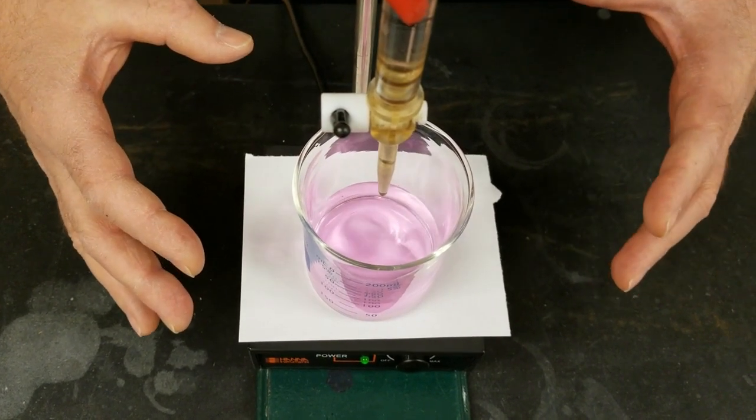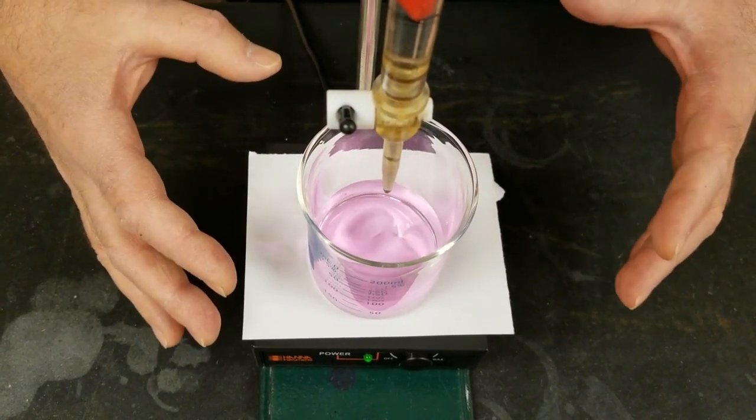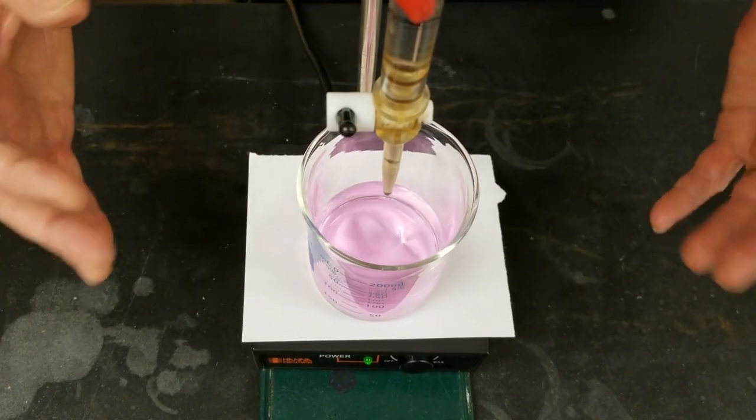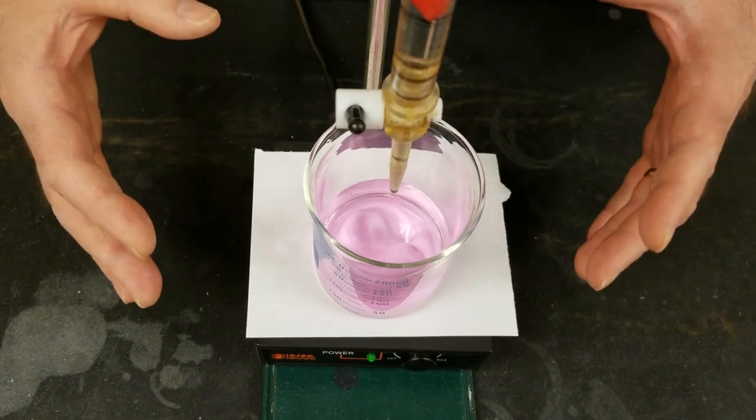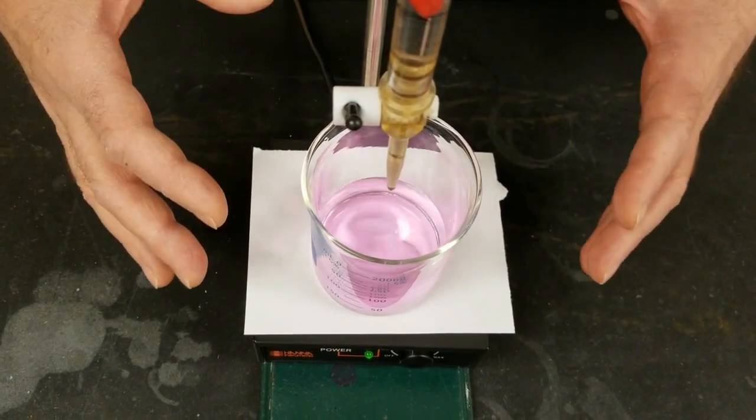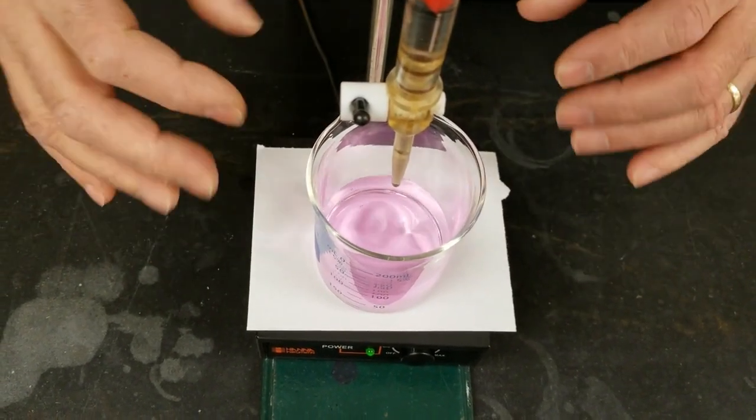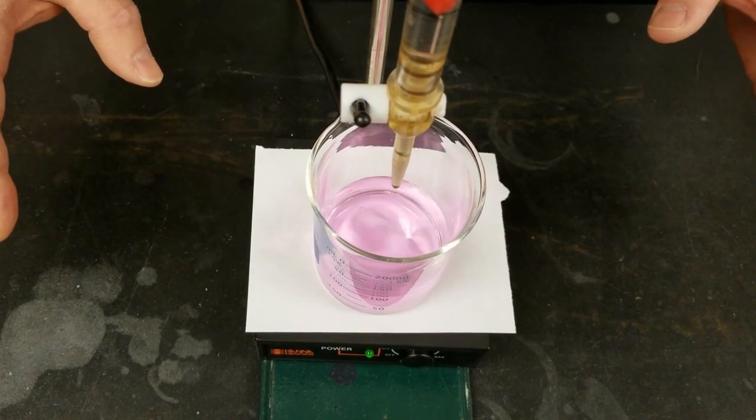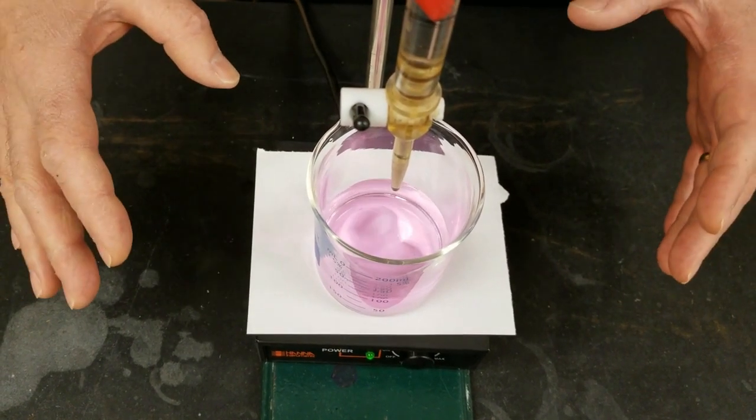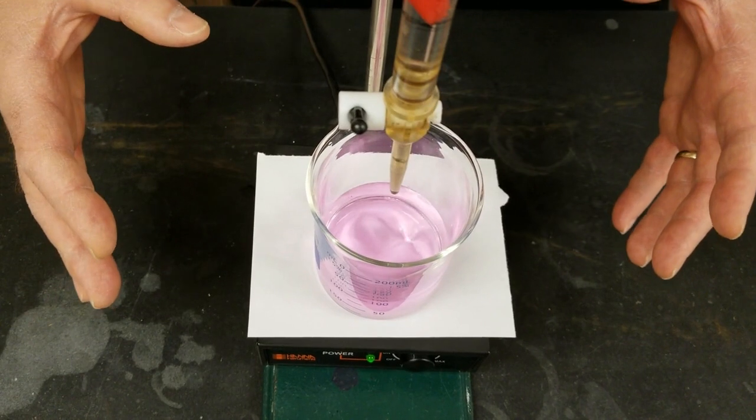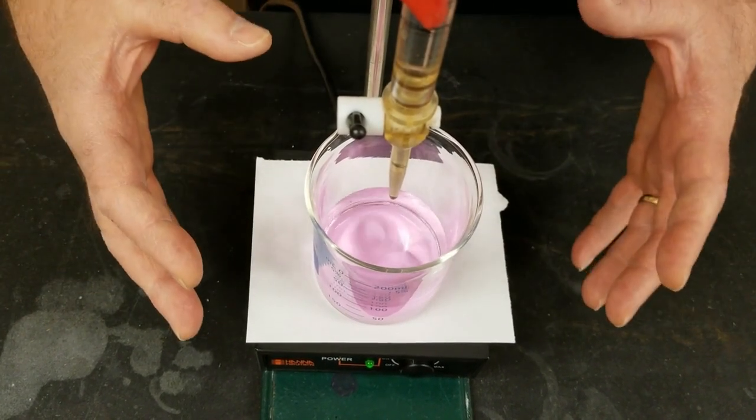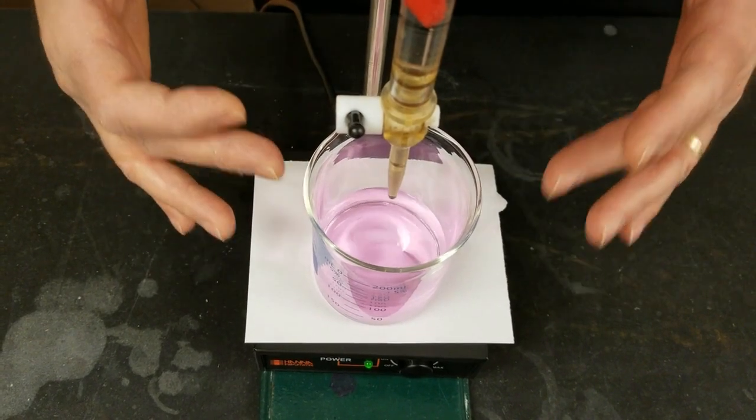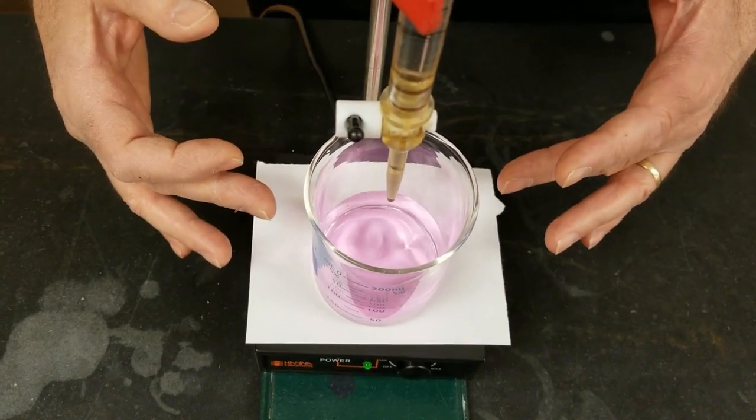So when you add OH- to this beaker, that OH- goes after the strongest acid if it's available. So the KHP being stronger reacts with the OH- first. When the KHP is all gone, the only thing left in there is the weaker PPN, very weak acid. And so what we can see here is that this is now the end point of the titration.